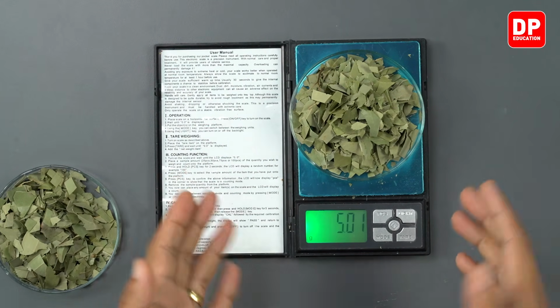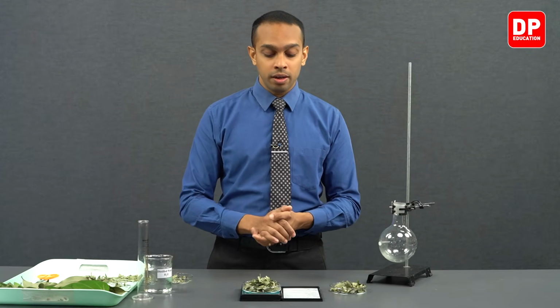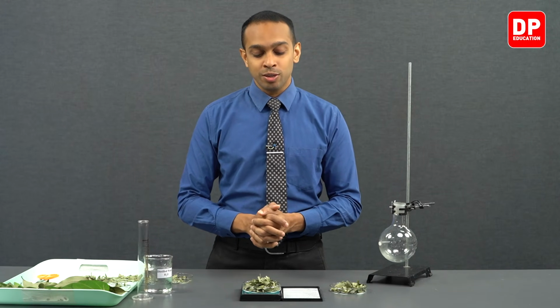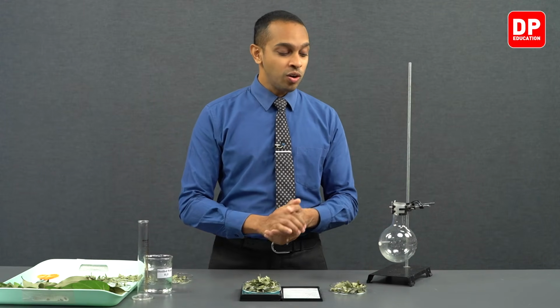Now, in this petri dish also we have measured exactly 5 grams of cinnamon leaves. So together in these two petri dishes we have 10 grams of cinnamon leaves. So we can now transfer these cinnamon leaves onto our round bottom flask that we have here, and then we are going to proceed to add our water and then move on to setting up this extraction setup.